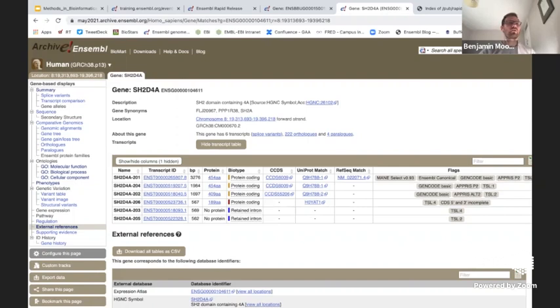Before I finish up with the final few slides, there's just one unanswered question in the Q&A box that I'm going to try and answer now. So it comes from Afira. It says, I have a query. What if we retrieve data from an old release? Will the retrieved information be applicable for publication? So I think the answer is yes.